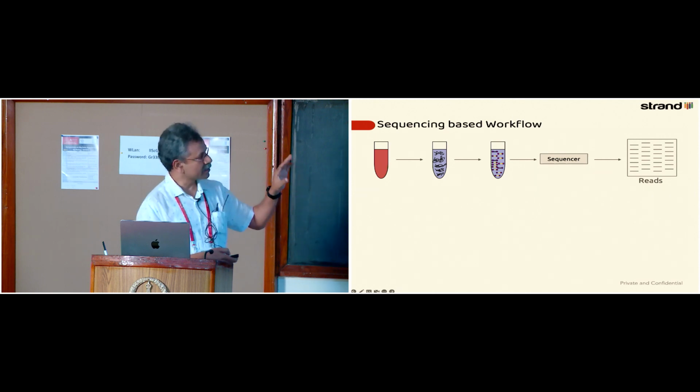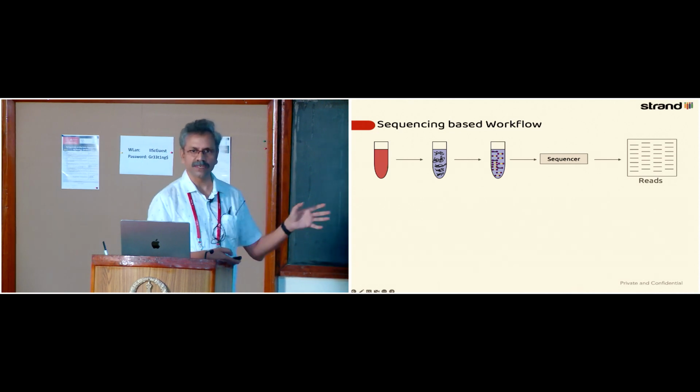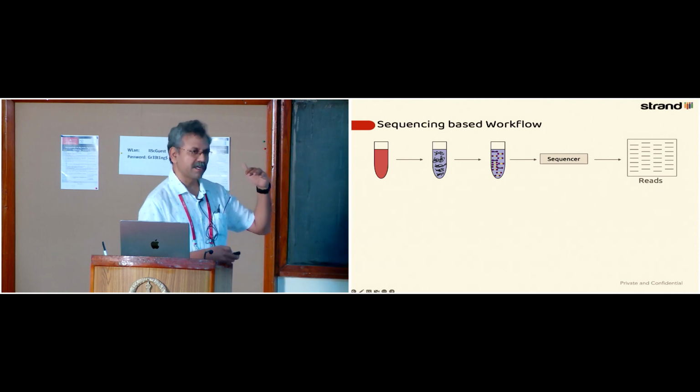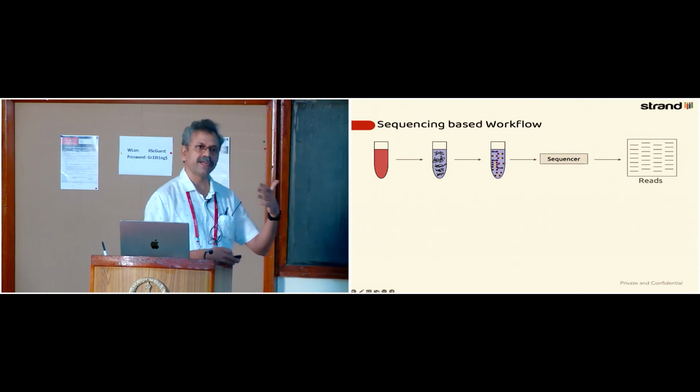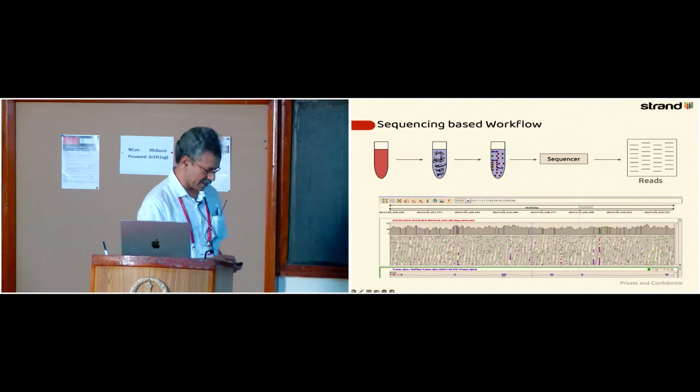So that set of reads represents the entire set of genomic sequences that were derived from somewhere on those 23 chromosomes. That part is clear, right? So now we take all of those strings that are out there, and now we have to match that against the genome to say where did each one of those reads come from. And we do that, and that will be called alignment.